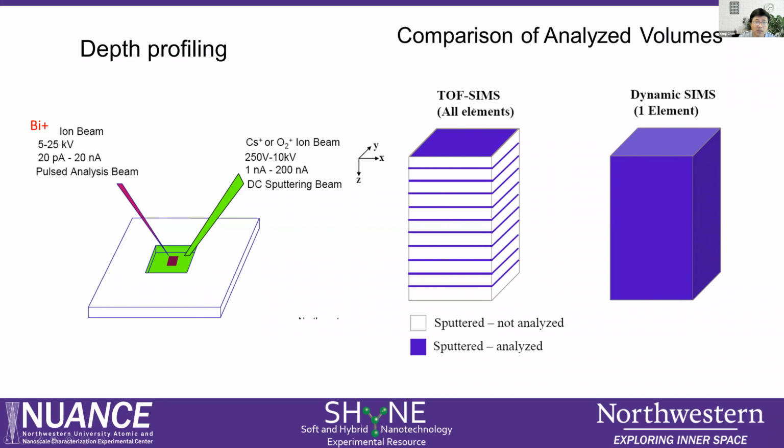And ToF SIMS is a different mechanism. The color you see here is analysis, and the white color is sputtering. When you do the sputtering, the analyzer doesn't work.